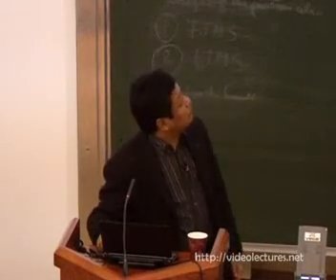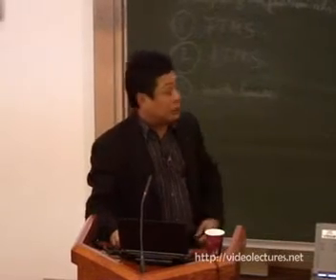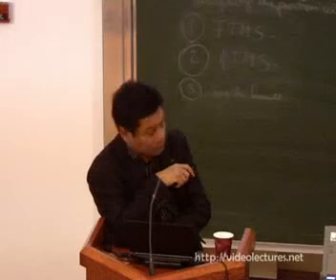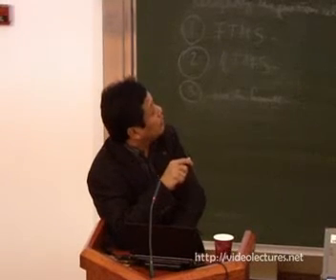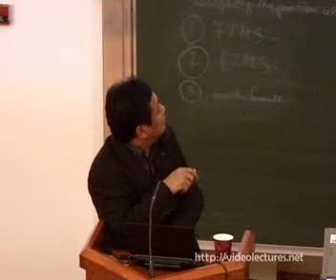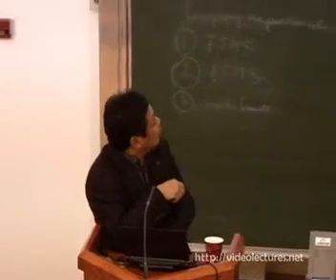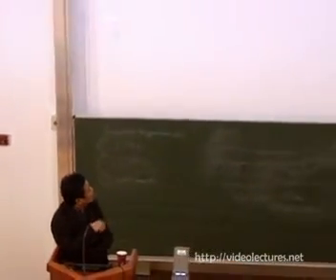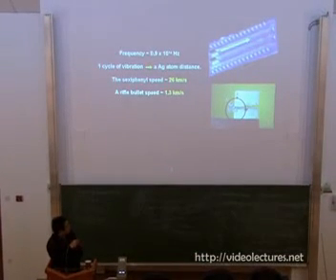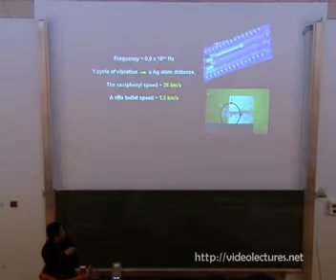Now, we can calculate the frequency of this movement because we know the energy, we measure it by the electronic structure. It turns out that the frequency equivalent to that energy is 0.9 times 10 to the power 14 hertz. One cycle of vibration is one silver atom distance, as we know how they move. If we convert that to speed, it turns out to be 26 kilometers per second. If I compare with the fastest bullet speed, 1.3 kilometers per second. So this is, of course, in the nanoscale. This is in our scale. But I would say this is still the fastest gun in the world at the atomic scale.